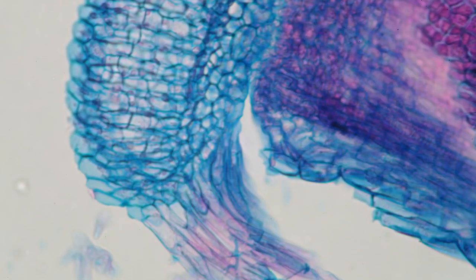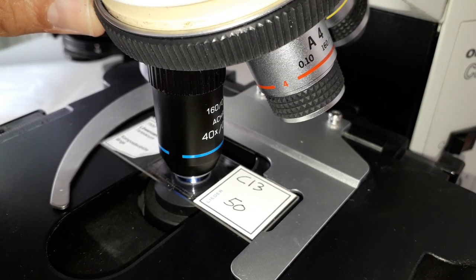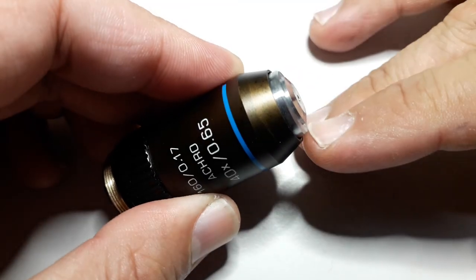That's basically a magnified image here and the crack is quite well visible. This is the way it should look like — that's a good objective, the structures are quite clear. But when you look at the same specimen using the damaged objective, you can see it's very blurry. The contrast is extremely low. So I think I don't have to feel bad about taking this one apart.